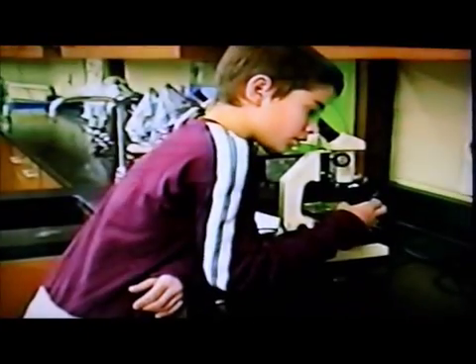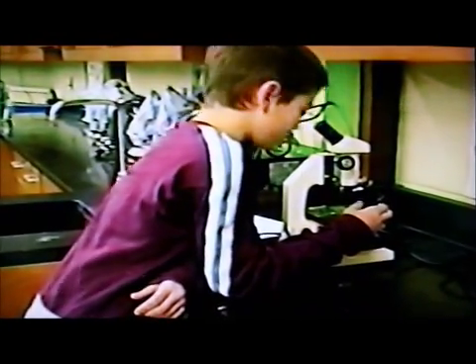Neat. Now we're looking at nematodes. And what do you have under the microscope? A vinegar eel, which is another free-living worm, this time a roundworm. It is usually found growing in vinegar, and it's the first animal to have a one-way digestive system. Are there any parasitic ones that are nematodes?